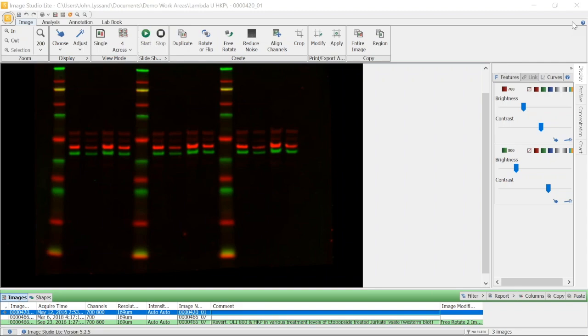If the validity of your housekeeping protein is in question, or if the housekeeping protein you're planning to use is known to be affected in your biological system, then it's best to use an alternative method such as revert total protein stain. For the rationale behind using this type of strategy, and for more information on selecting a strategy, it would be best to review the earlier lessons in this course.